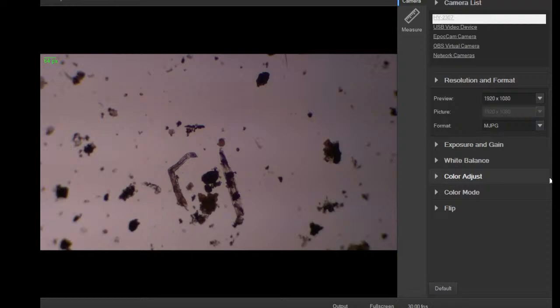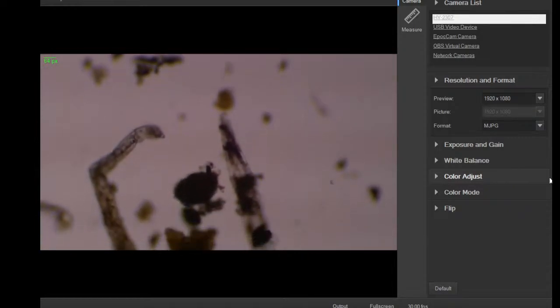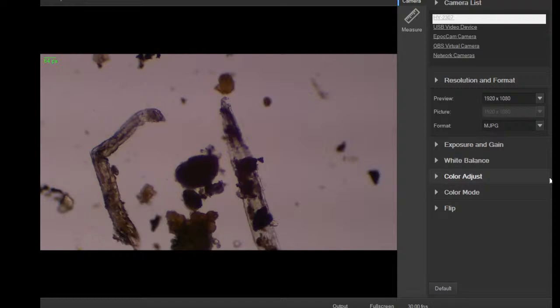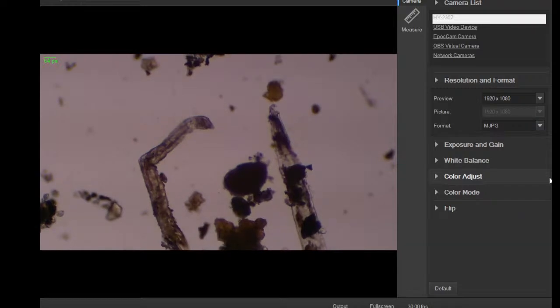It's almost like, if it were a different location, I would say this was like a diatom or something, but it's just pieces of plants and such. Fix that focus again. Okay. Oh, there we go. There's a little guy moving around. You'll find something eventually. It's like a little ciliate.